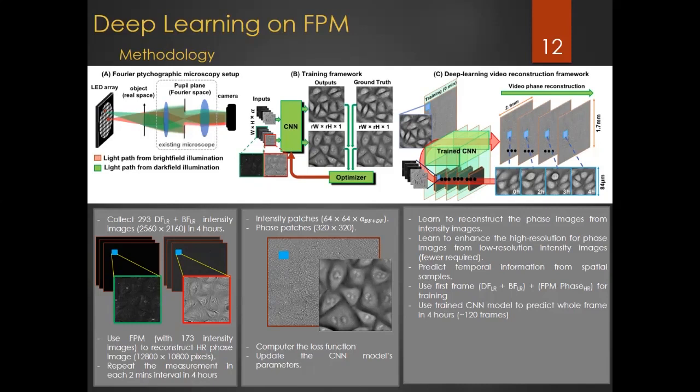The training process happens only one time, but later on we can apply it to much data, and it will converge and give us the right answer.